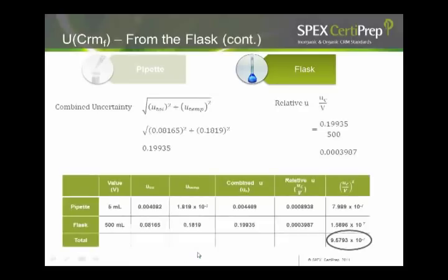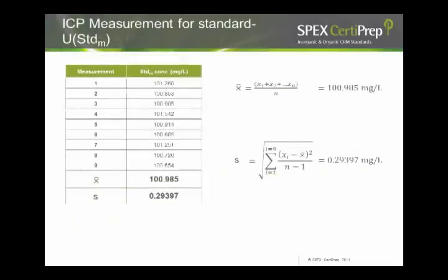So to calculate the uncertainty for standard P, we did two components already: weighing on balance and the volume component due to the 500 ml flask. Now there is a third component, SRM certification. SRM certification had the certified value for gold at 9.89 milligram per gram. It had an expanded uncertainty of 0.02. The coverage factor stated there was 2. So you have to convert that to standard uncertainty. You divide the uncertainty given in the certificate by 2. So you arrive at a value of 0.01. Now you calculate the relative uncertainty for this approach, and you arrive at a value of 1.011 × 10^-3.